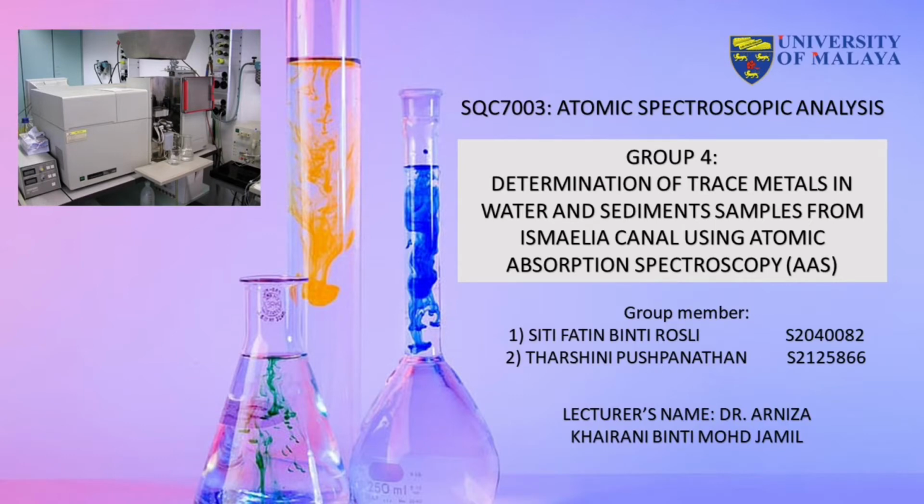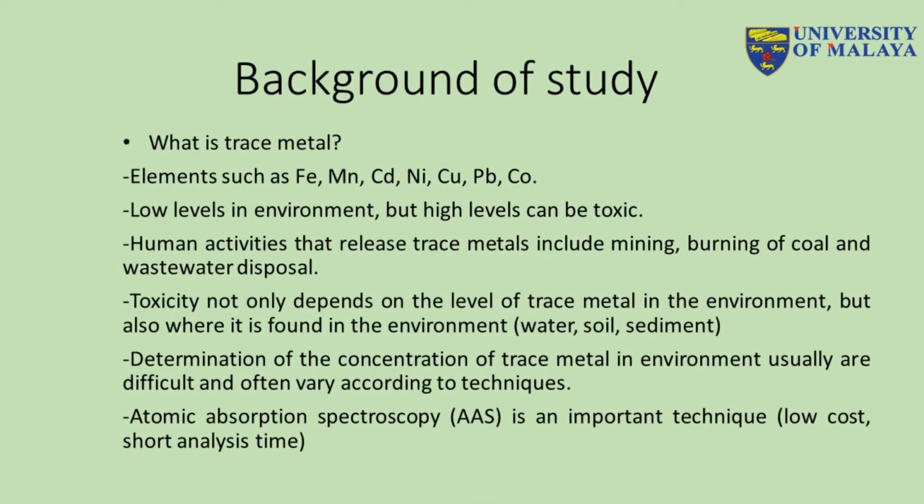Together with my partner Tarshini, we'll be presenting about the application of atomic absorption spectroscopy in environmental analysis. Both of us decided to talk about the determination of trace metal in water and sediment sample from Ismaelia Canal using atomic absorption spectroscopy. So what are trace metals and where do they come from?